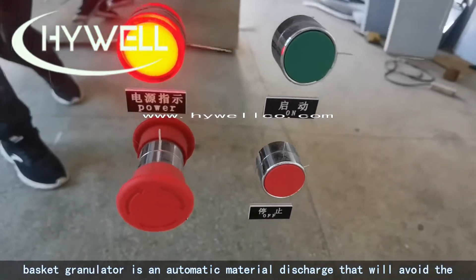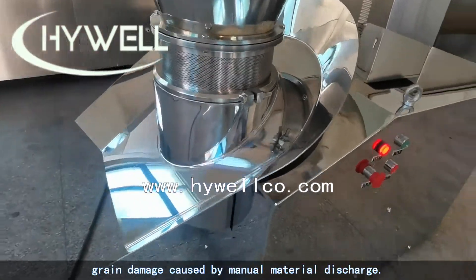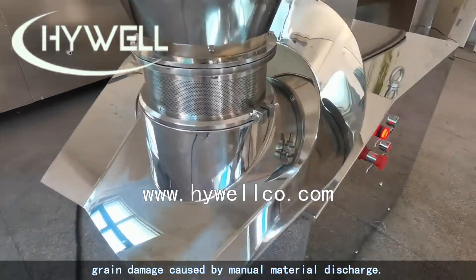The basket granulator features automatic material discharge, which avoids the grain damage that can be caused by manual material discharge.